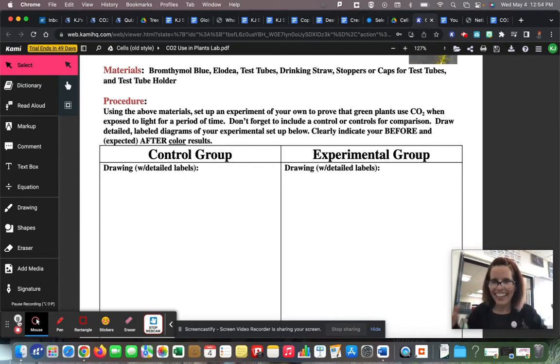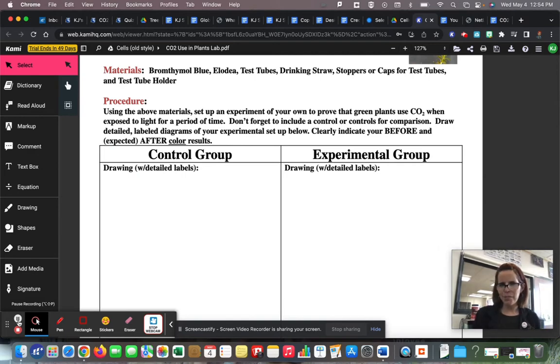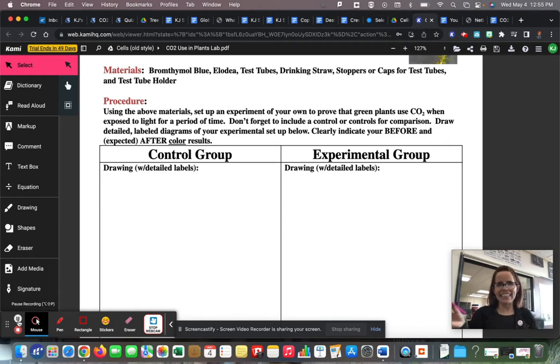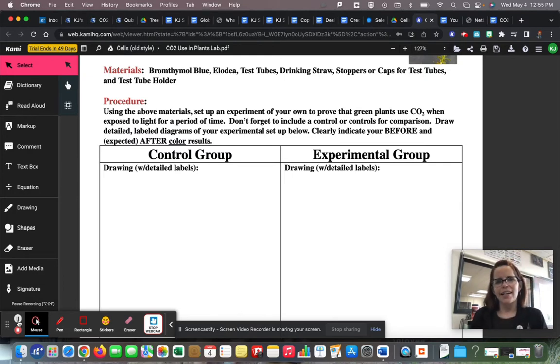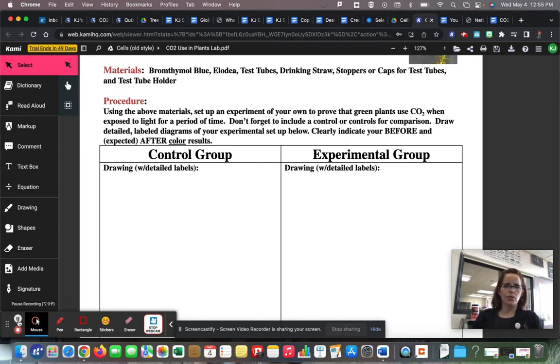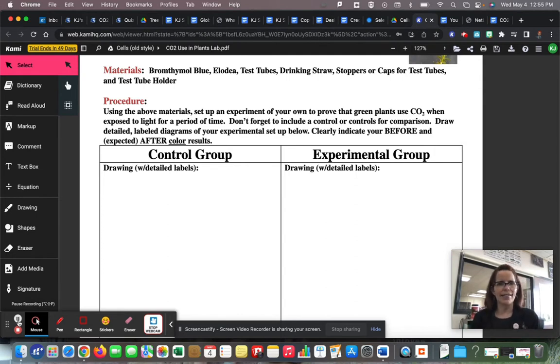When we design this lab, students often ask what the straw is for — are we supposed to be drinking something? No, we're going to use the straw for blowing bubbles. We exhale carbon dioxide, so we're going to use the straw to add carbon dioxide to a sample of water, and then we're going to ask the plant to suck up the carbon dioxide that we added.